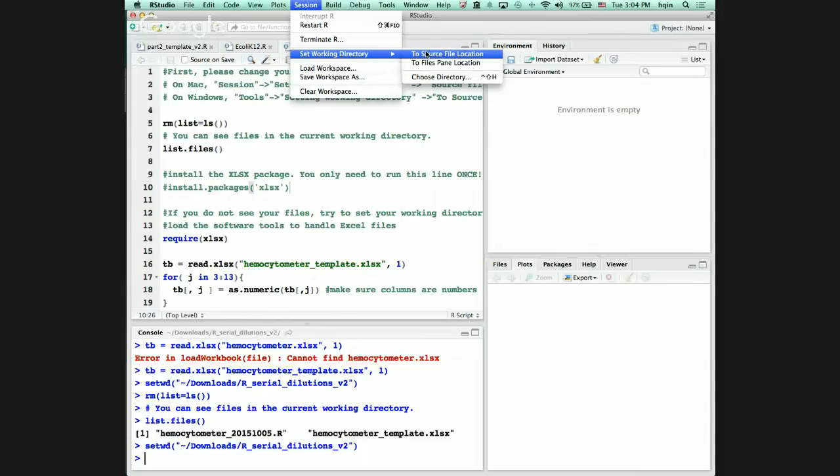You open using R. Go to RStudio to do everything again. Yeah, do everything and redo it. That's RStudio, yeah. Go to RStudio.